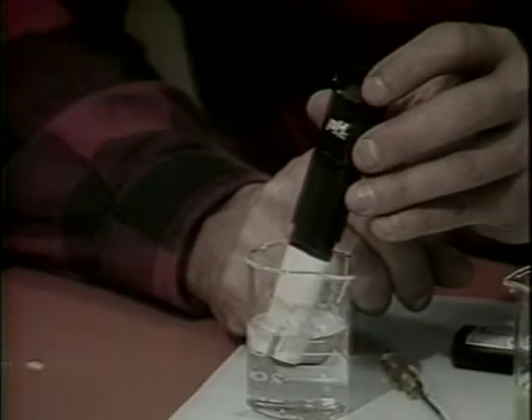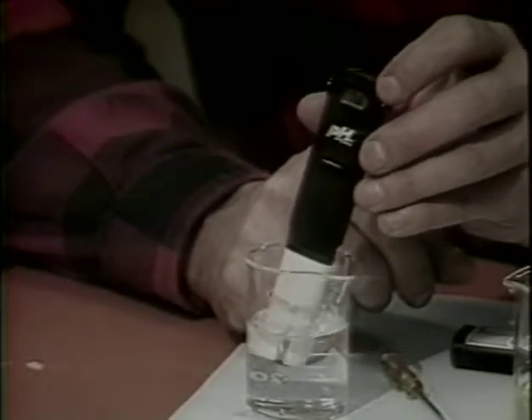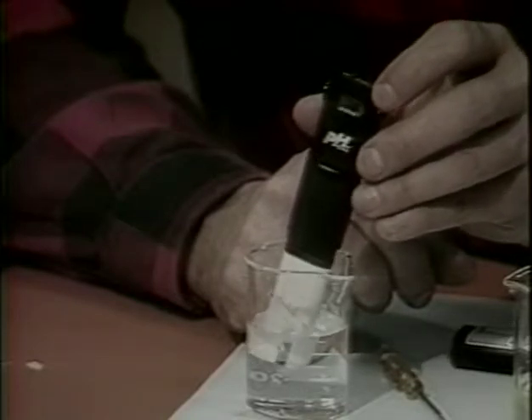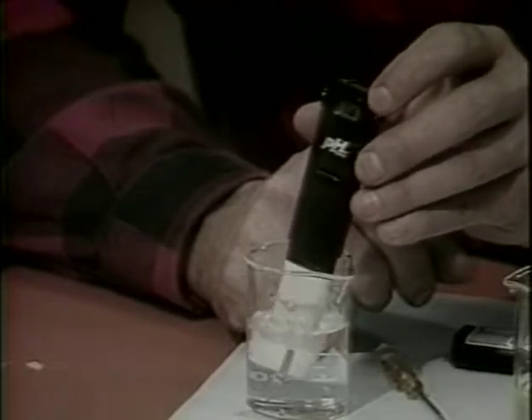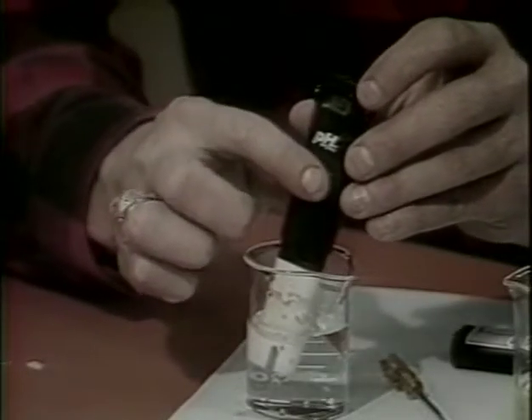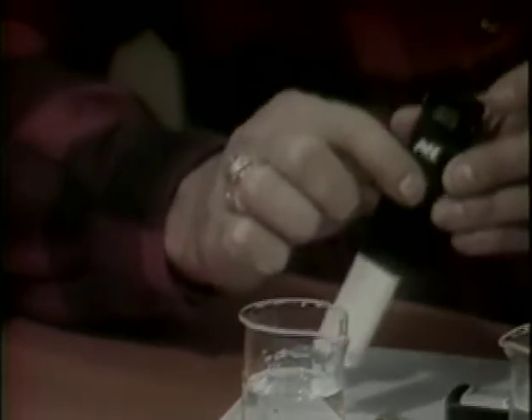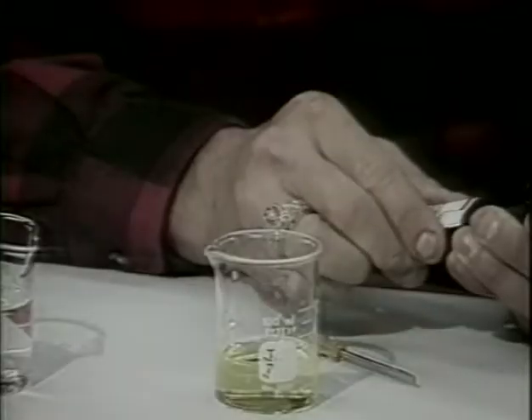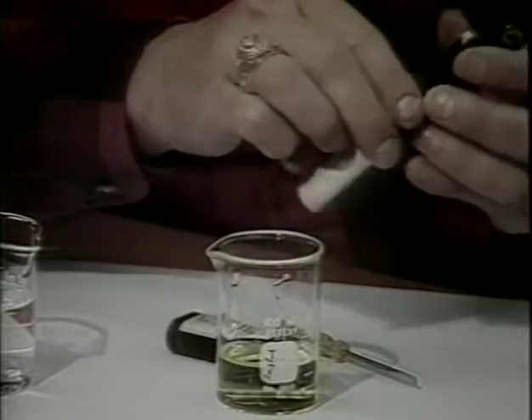The pH may also be measured with a meter, but most meters are expensive. However, a less expensive version of a typical pH meter is available. An example of this is commonly called a pH pin. To use this instrument, proceed as follows. Remove the plastic boot from the meter.